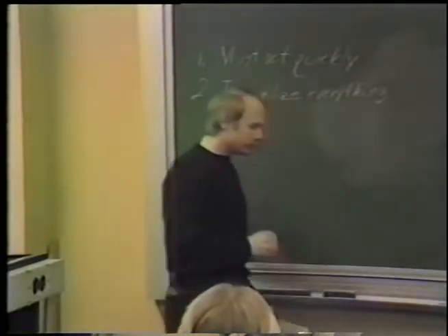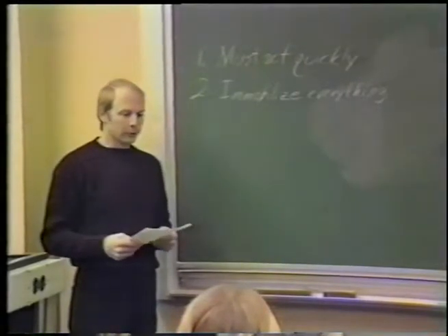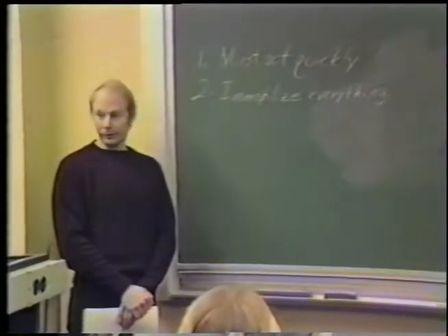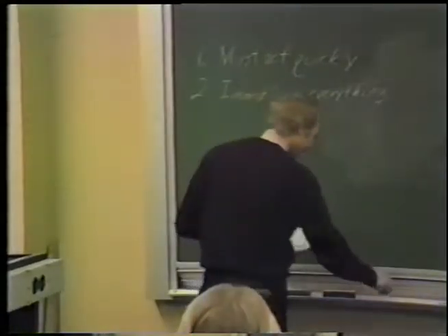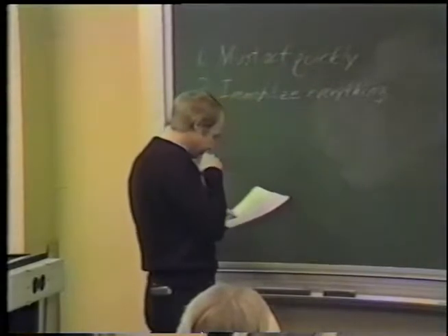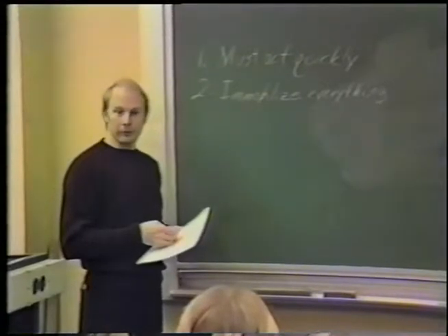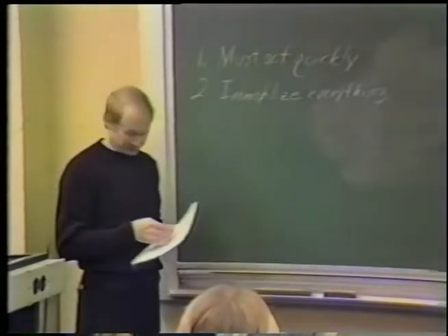Because not everything is fixed, those particular molecules or structures that are not fixed can and do migrate and change their morphology. Again, we'll go into that in a few minutes. In addition, certain enzymes can remain active even when they're fixed, notably lytic enzymes. And this can lead to problems also.